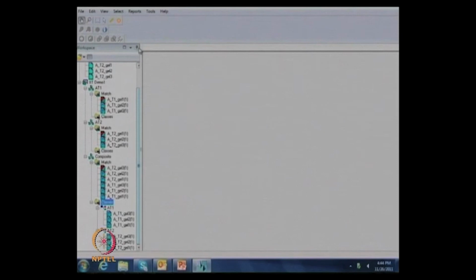Now it can be very easy, one can easily go through that, and this particular table you can easily export to Excel also. From there you can have your complete data also. This is the complete analysis output the software gives you. So I guess it was very useful to see the different steps required for performing this analysis, and also the software gives you a lot of options for doing different fold change and statistical analysis of how significant the data is. And then one can still go back to those spots which the software says are significant and look at each spot manually to verify that it is a real spot.